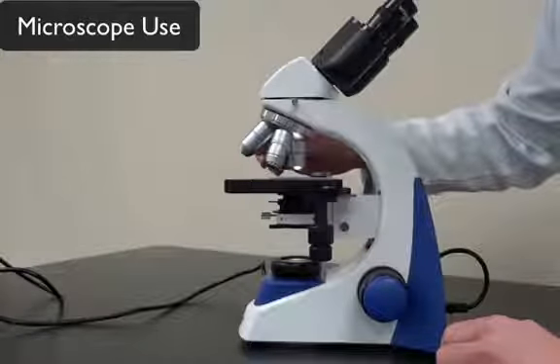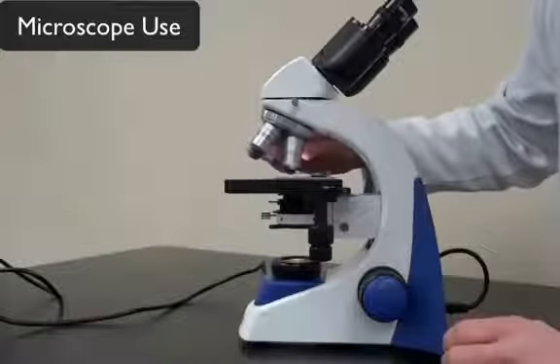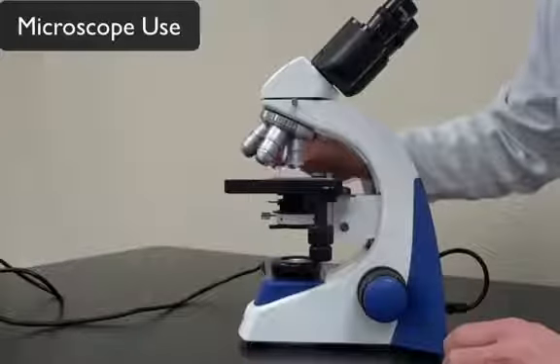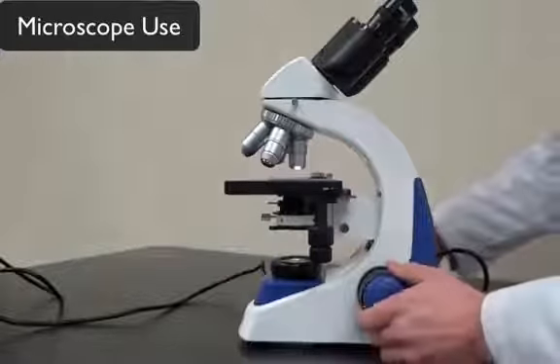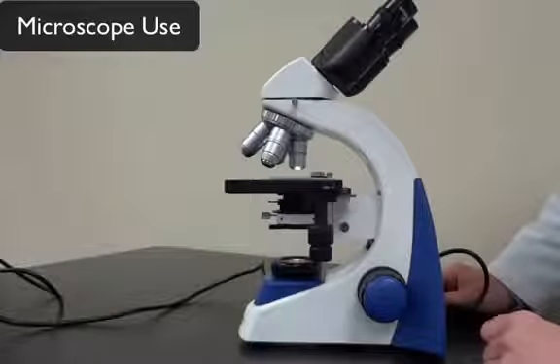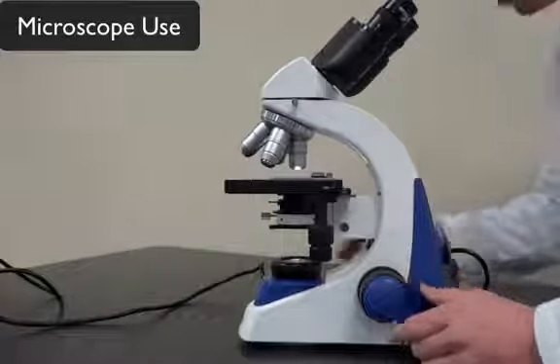If we switch over to like the low power here, it's still okay, but if we go to the high power, it's going to crack the slide and damage the objective lens. So we always start off in scanning power, and there's a number of reasons for that, which we'll elaborate on in the laboratory assignment.